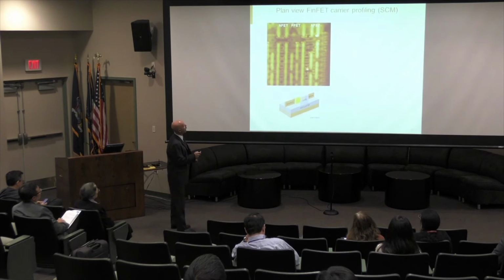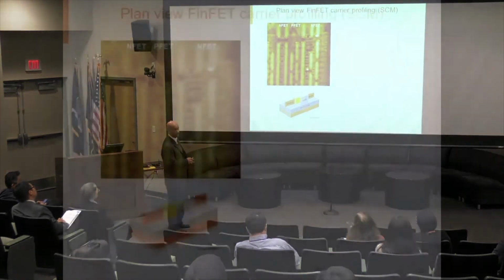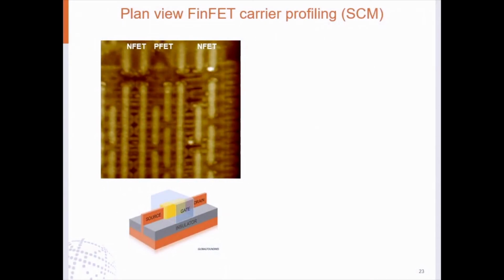This is some work that we've done in plan view using scanning capacitance microscopy. This is a topographic image, where we've basically mechanically polished down into the fins. So these bright areas are the actual fins, and we've got a series of NFETs, PFETs, and more NFETs.